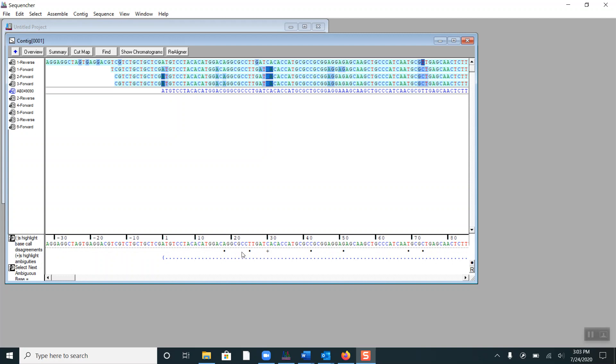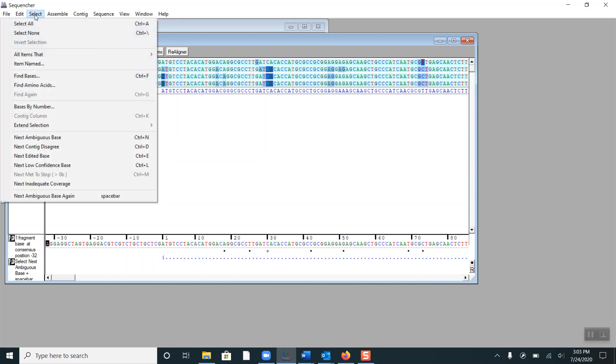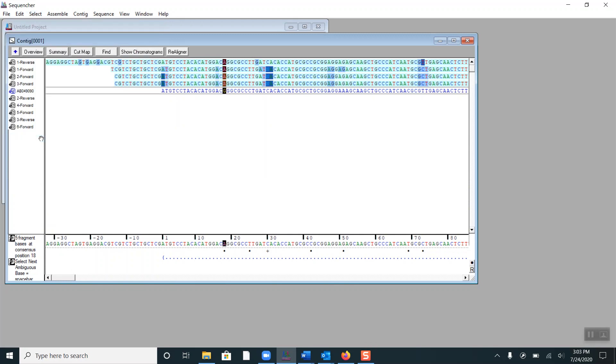The first thing I'm going to do is highlight the first base in the consensus sequence. I will go to Select Next Ambiguous Base, and this automatically takes me to a disagreement at base 18.